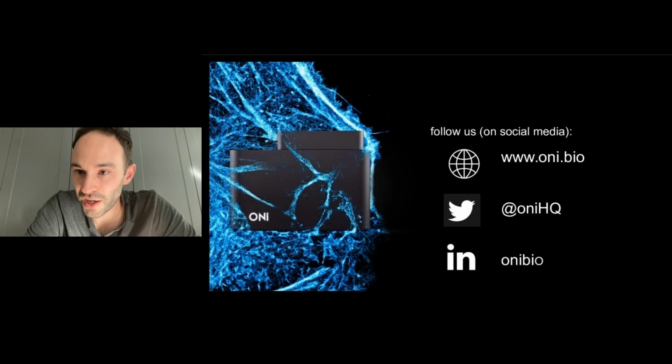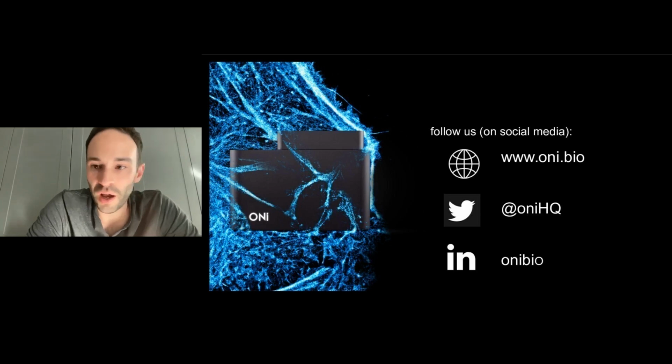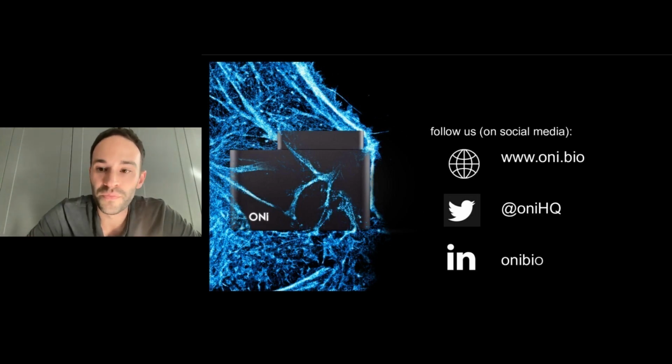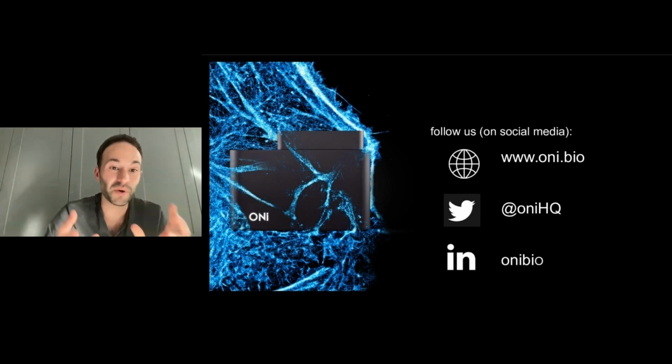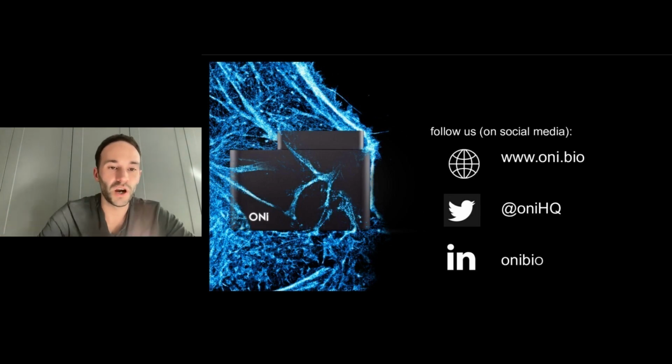And then there's a question here: can it do live cell imaging with drift correction? So yes, it can do live cell imaging, and drift correction is inbuilt into the software, so that would be done post-processing. Drift correction is most effective on fixed samples because the drift correction algorithm looks at points over time and then tries to track whether they've moved in various dimensions over time. However, if you were doing live cell imaging, it would be a bit more complicated because things would be moving. But if you're looking at a large structure like a cell, which is what you would be doing with live cell, then the drift correction would work.